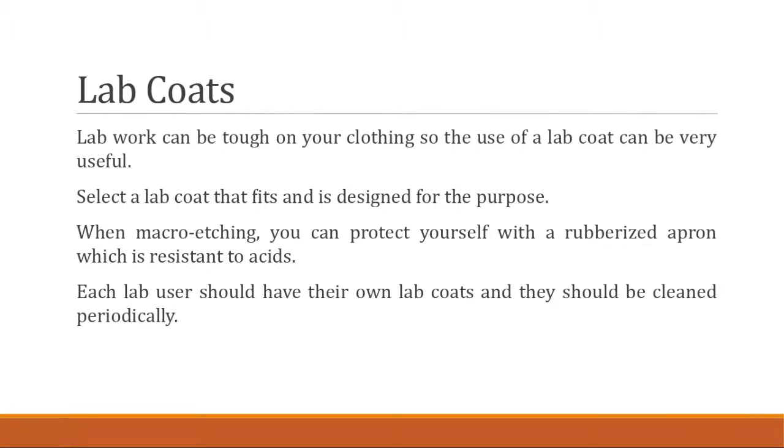It's good if you have your own lab coat because it's designed for your fit. We don't have a one-size-fits-all type deal. When macro etching, it also helps to protect yourself using a rubberized apron, which is resistant to acids. But you're not going to have to really worry about that. Like I said, these are just tidbits of information I just want to share with you.